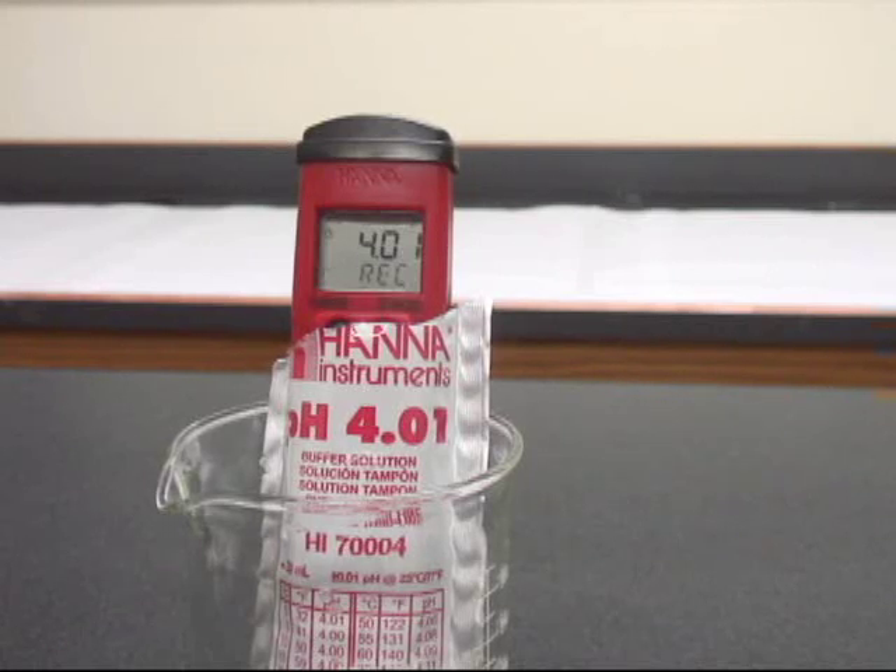When it has accepted the calibration automatically, you'll see it jump right back into the normal measurement mode and you're good to go. It's really as simple as that.